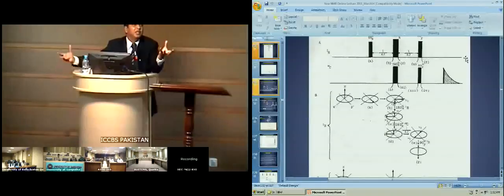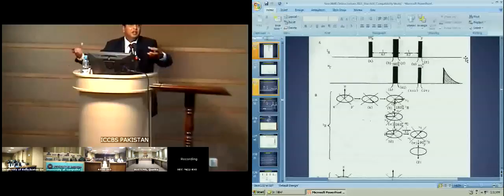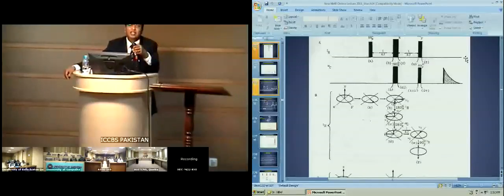You see, these pulse sequences become an integral part of various experiments in which people are putting them together and creating something absolutely wonderful. Now we all understand that transfer of carbon to proton means that the intensity of the proton signal will be fourfold decreased. We all understand, right? As we see that from proton to carbon there will be a fourfold increase, right? This fourfold decrease is an inverse technique, and you do it for a different purpose, which we will discuss.